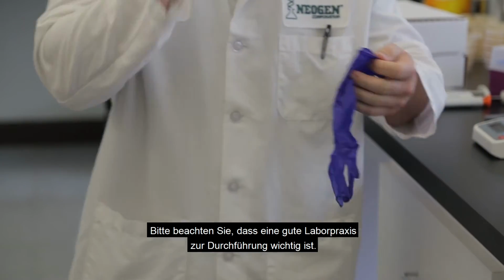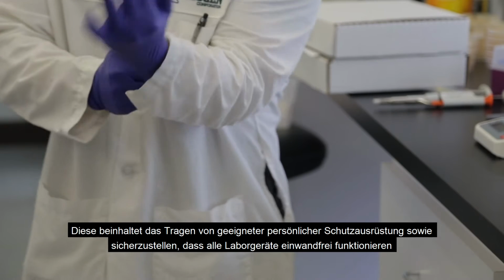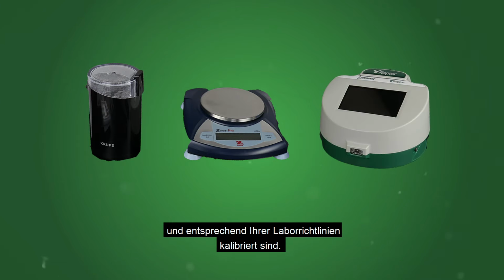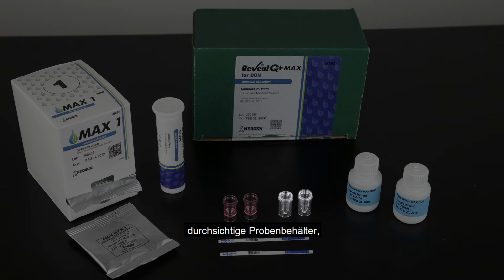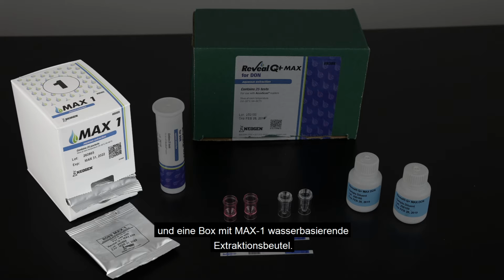Remember, it is important to use good laboratory practices. This includes wearing proper PPE and ensuring that all equipment is working properly and is calibrated in accordance with your laboratory's policies. Each kit contains supplies to test 25 samples. The kit includes test strips, clear sample cups, red dilution cups, 2 bottles of sample diluent, and 1 box of Max 1 aqueous extraction packets.